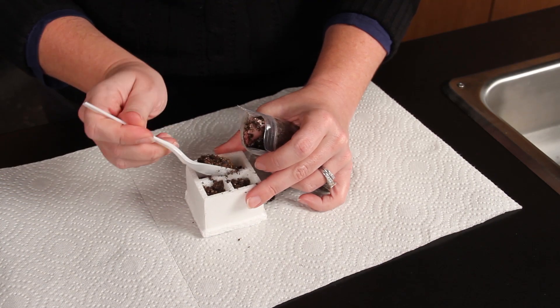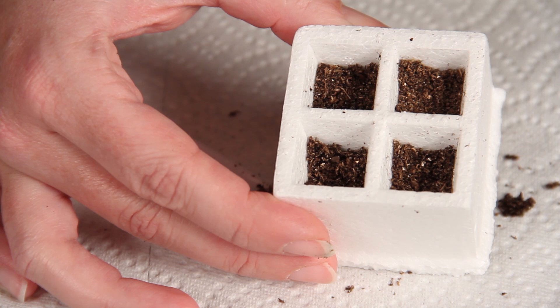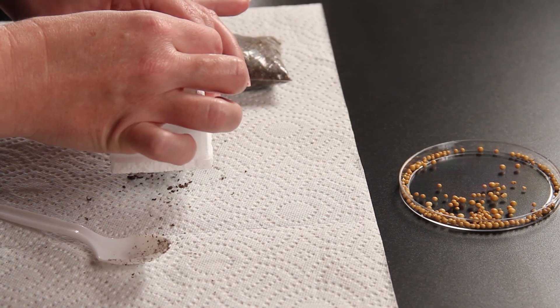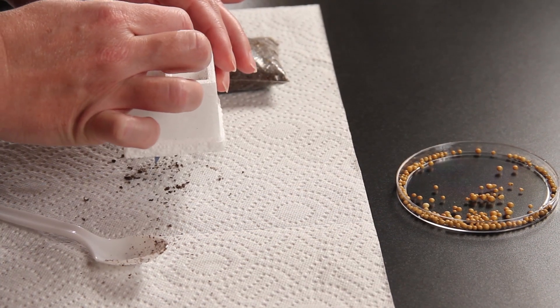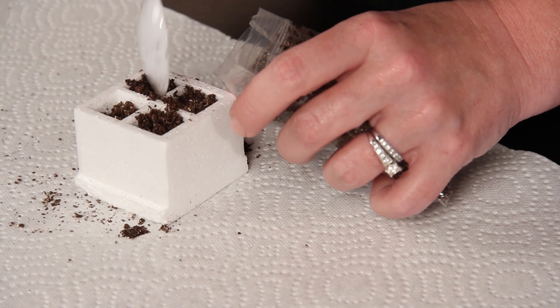Loosely fill each cell with the moistened soil about halfway. Add three fertilizer pellets to each cell. Fill the rest of the cell up with soil.